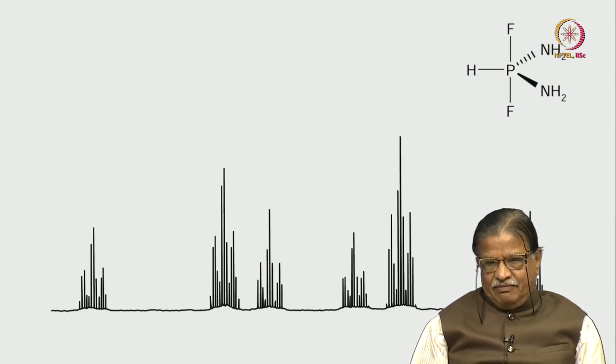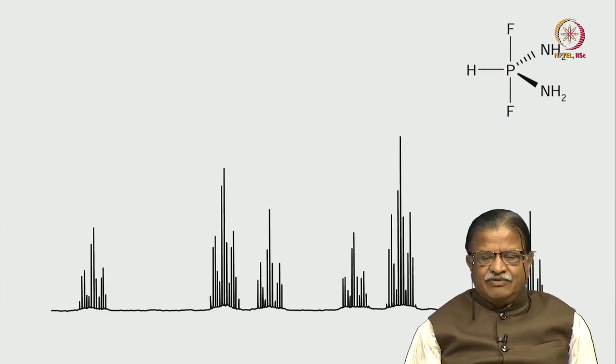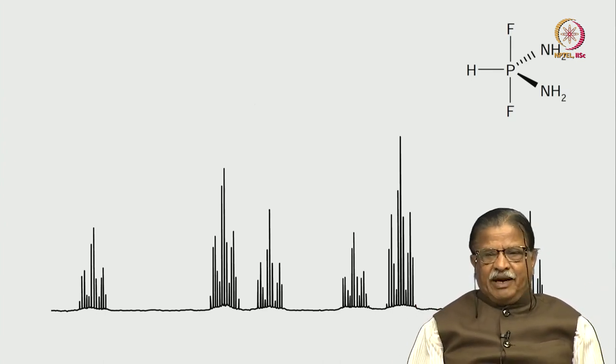Very interesting. You can see this in the book. I have taken this from the book of Inorganic Molecular Chemistry. Fantastic book. When I read that, I saw this very interesting example and I have taken it from them. I thank the author for allowing me to take the spectrum from that book. Very interesting example. Look at this. How do we get this pattern?